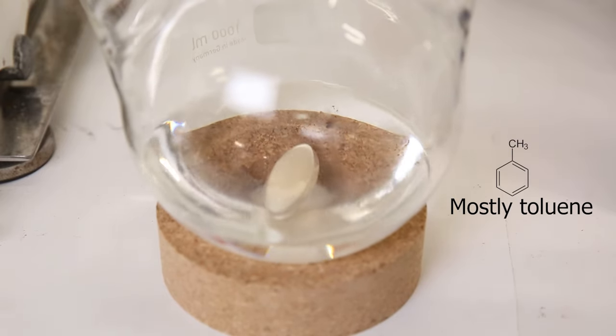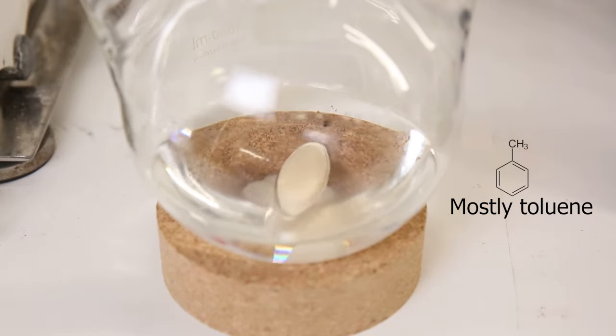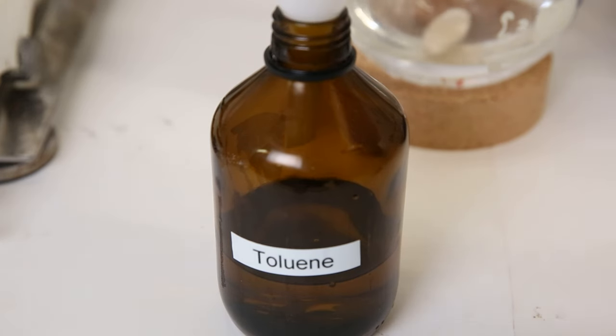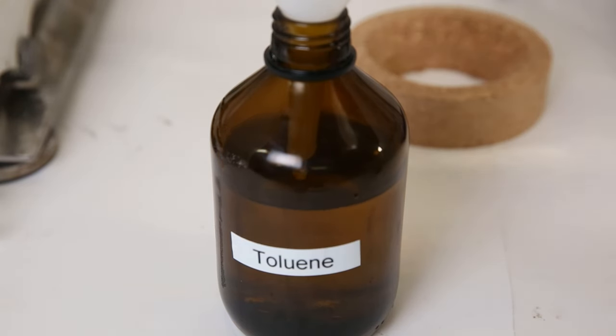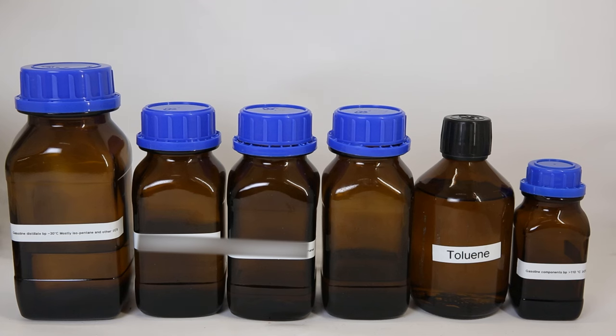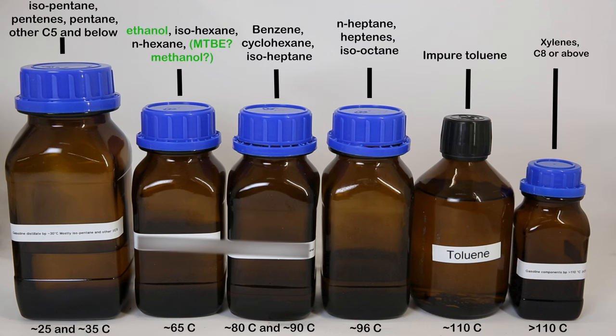Now it is not necessary to boil all of the rest. I will just add the remaining liquid to my impure toluene bottle. In the end, I created six different fractions of the gasoline.